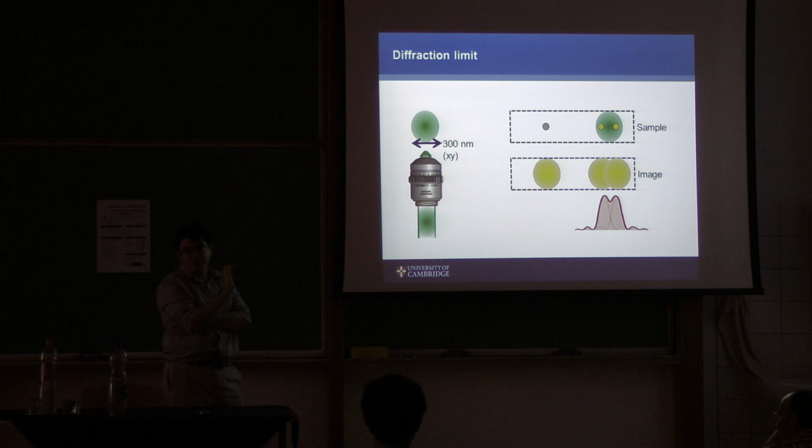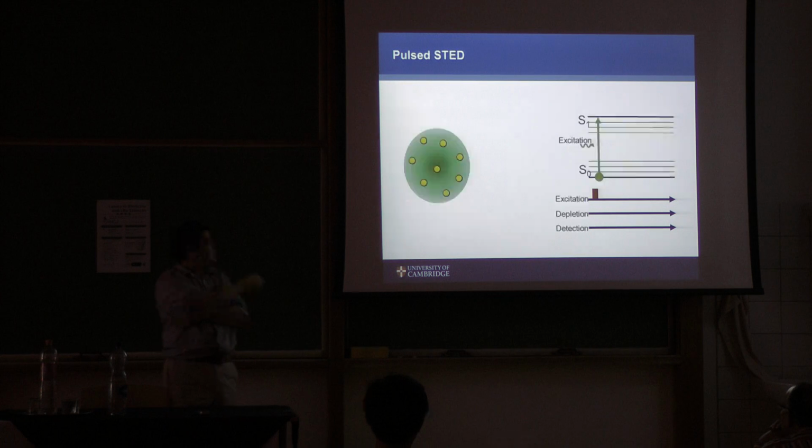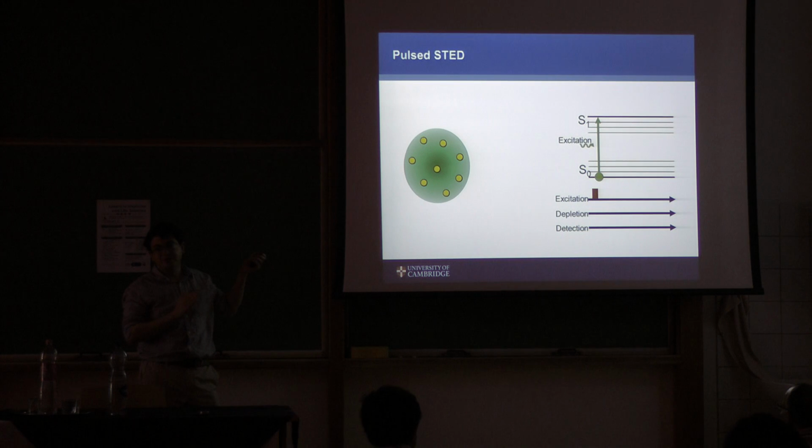So what I will look at before coffee is the expensive hardware method for doing super resolution microscopy, with a better machine, as a way of getting around this diffraction limit. So here are some fluorescent molecules, and imagine that I have a green laser spot, and this spot is as small as I can make it with optics.